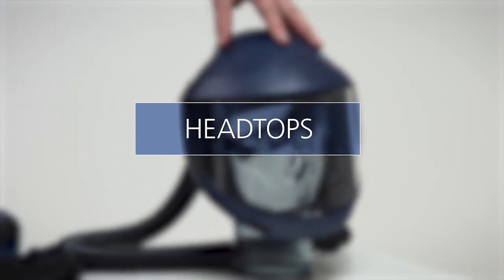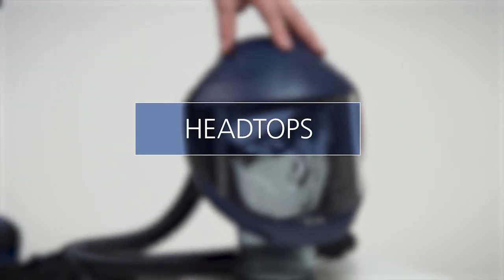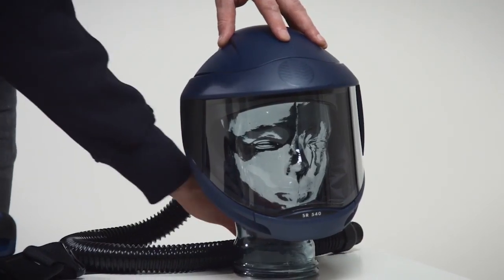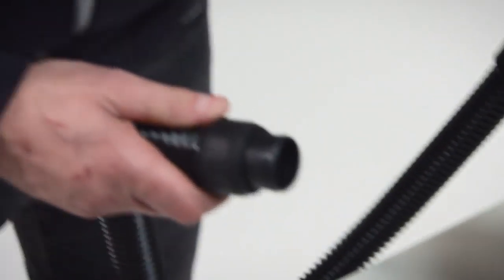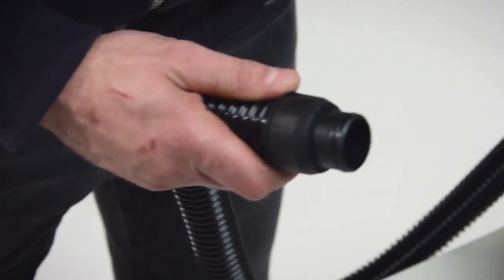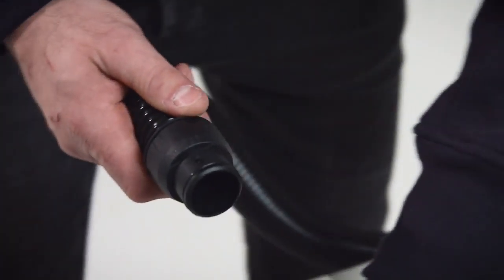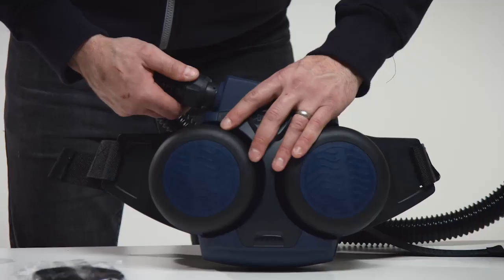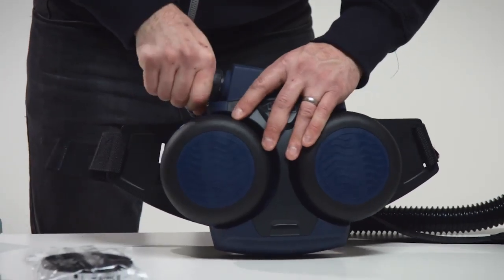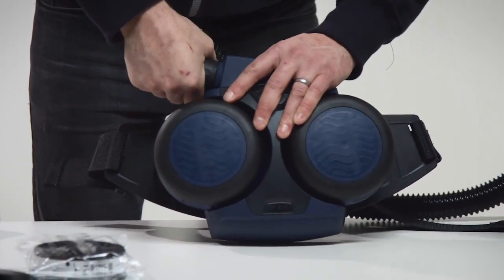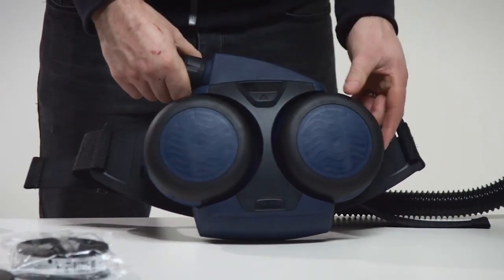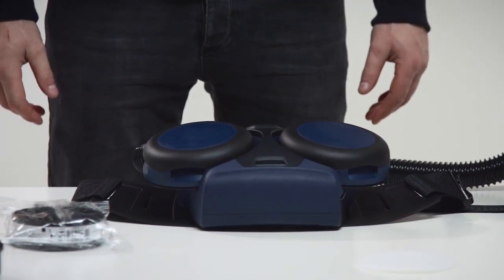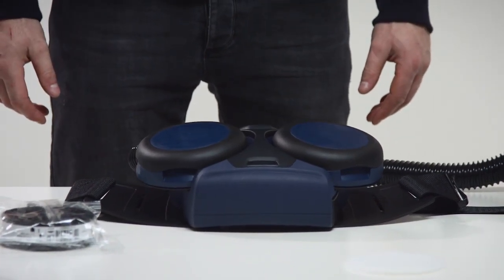Head tops. The breathing hose is not included with the fan unit but is supplied with the relevant head top. Mount the breathing hose in the fan unit and read carefully the user instructions accompanying the head top.